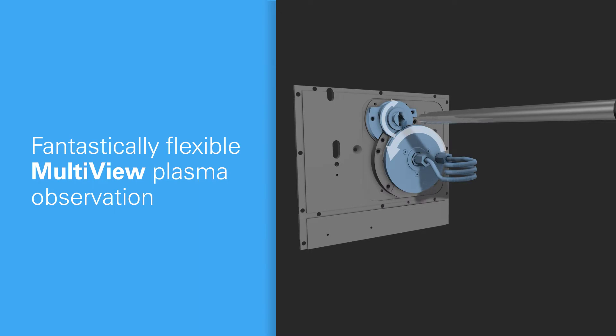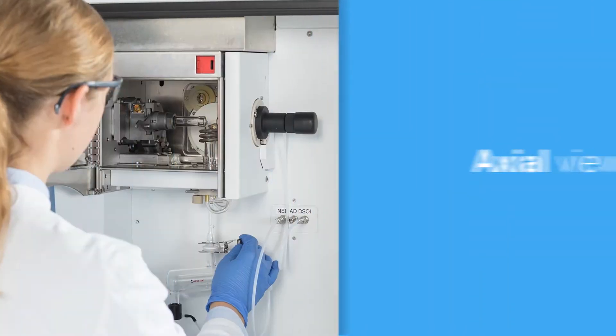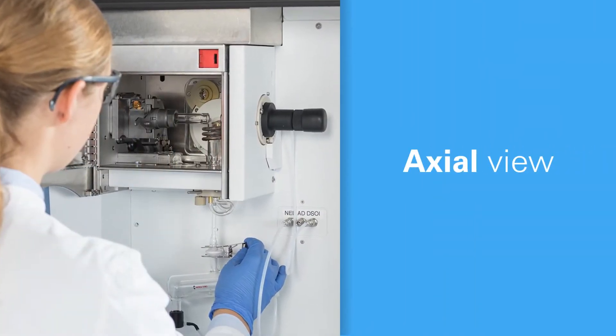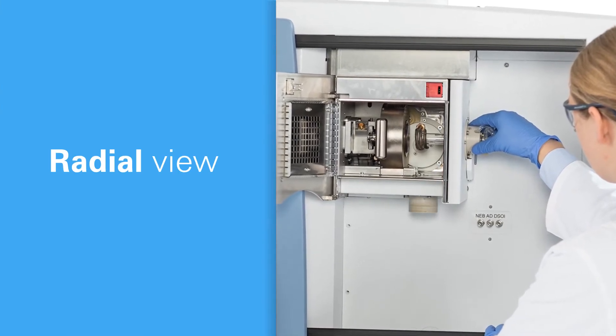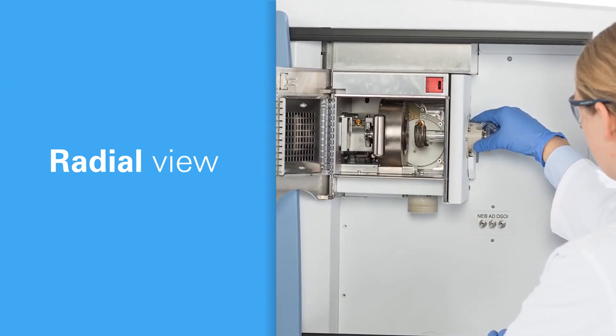Or for ultimate flexibility, make it multi-view. This unique no periscope, no compromise option lets you switch in only 90 seconds between two true plasma views: high sensitivity axial for trace analysis, or high precision radial single or dual side-on for maximum matrix loads and organic solutions.